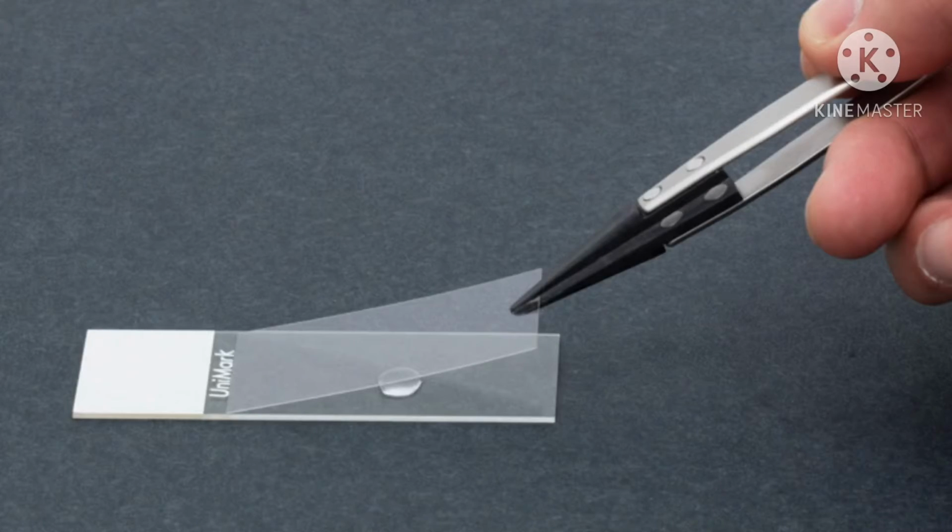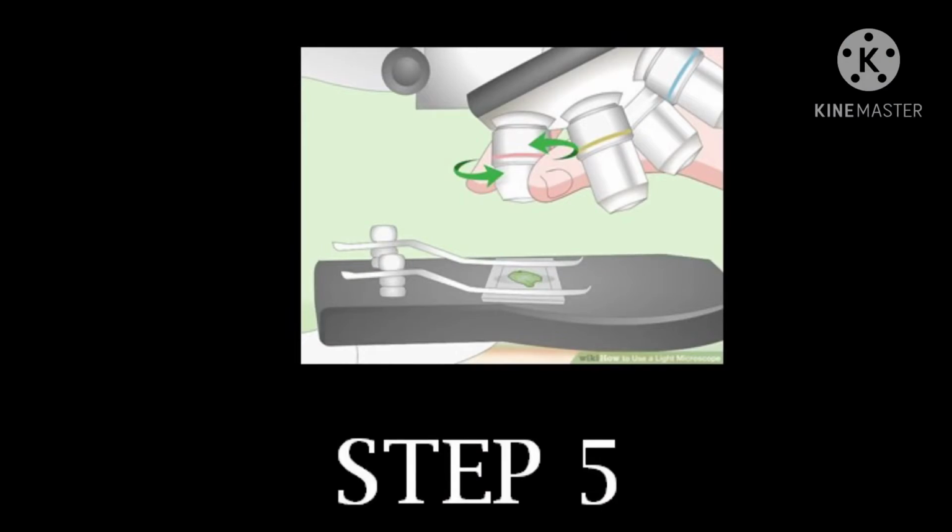The microscope slide should be prepared with the cover slip over the specimen. It could protect the objective lens if they touch the slide. Place the microscope slide on the stage and fasten it with the stage clips. Center it so that the objective lens is under the specimen. Look at the objective lens and stage from the side. Turn the coarse focus knob so that the objective lens will go downward without touching the slide.